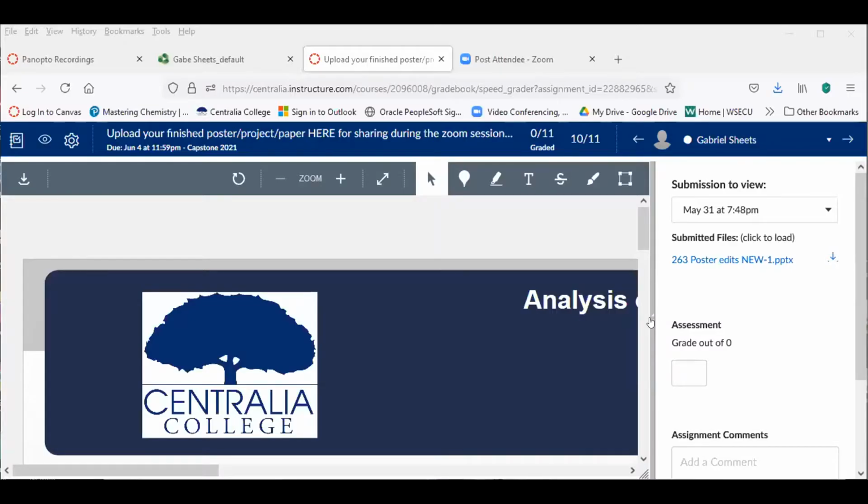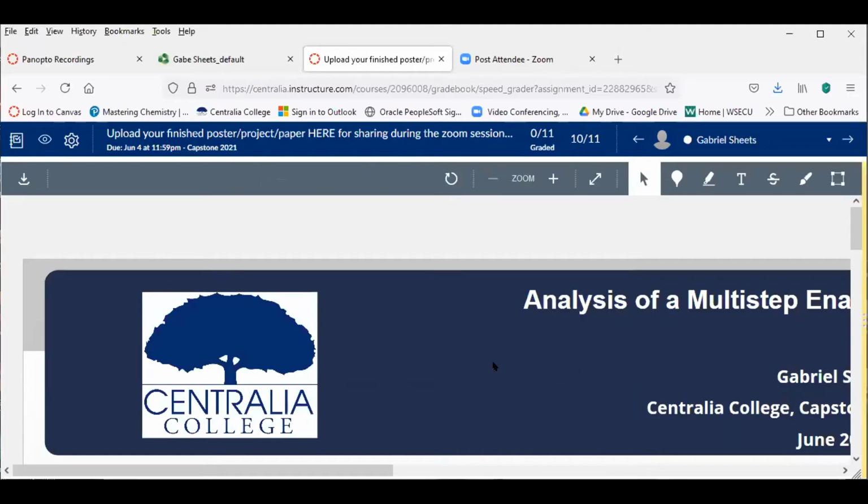I think the only thing for the unknown product would be that CO stretch. That'd be the biggest feature that you would see in the IR.